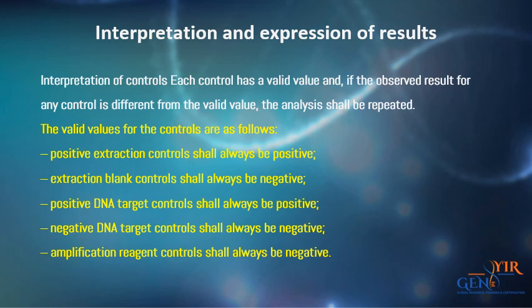Interpretation and expression of results. Interpretation of controls. Each control has a valid value and, if the observed result for any control is different from the valid value, the analysis shall be repeated. The valid values for the controls are as follows. Positive extraction controls shall always be positive. Extraction blank controls shall always be negative.